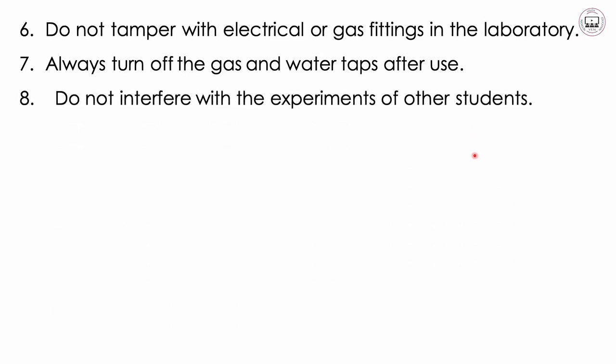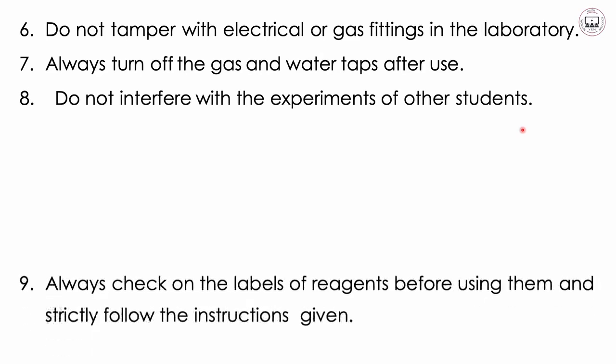Then 8, do not interfere with the experiments of other students. There are so many things that you might affect as you interfere with them. 1, you might affect the research. 2, you might remove their concentrations. And 3, you might also happen to break or damage other things which they are using.